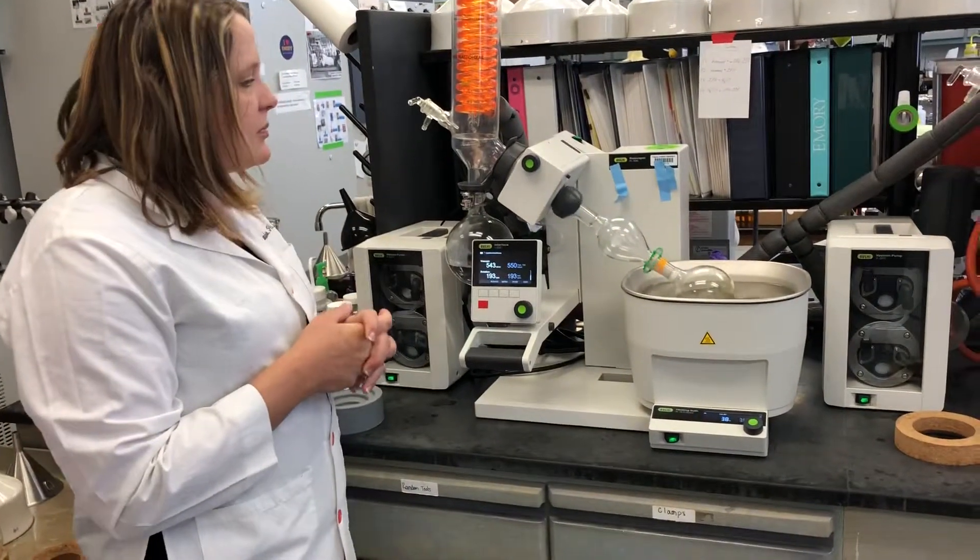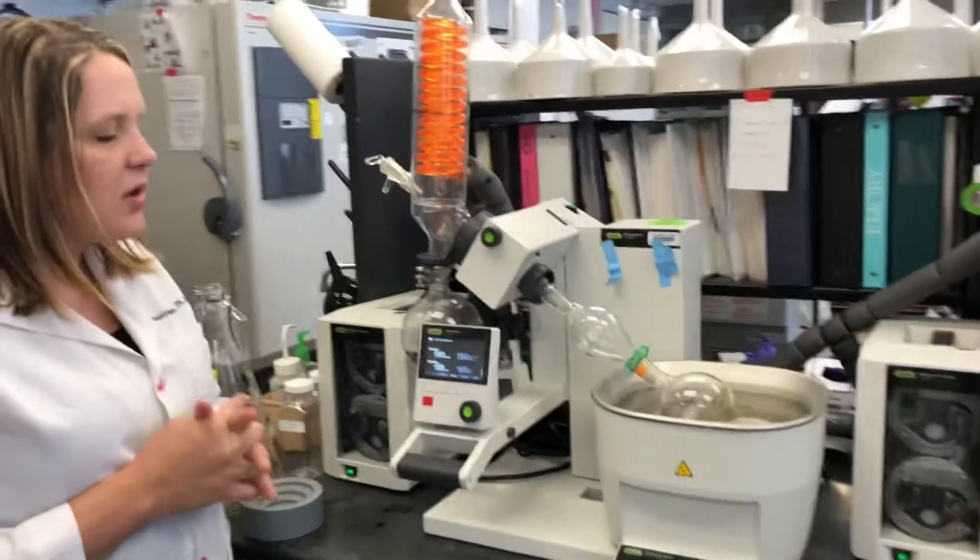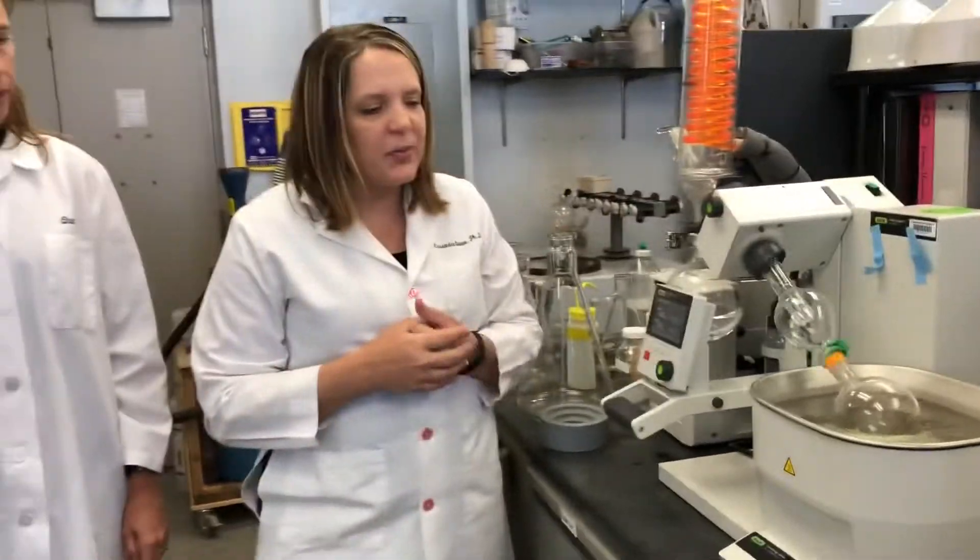How long does it have to be on this machine? It depends on what kind of solvents are present, but with ethanol it's usually under an hour.